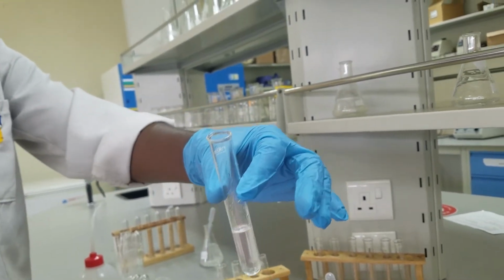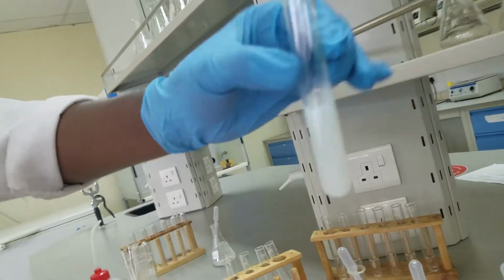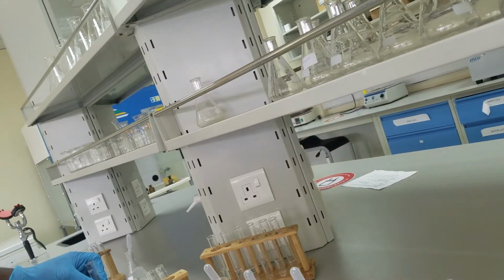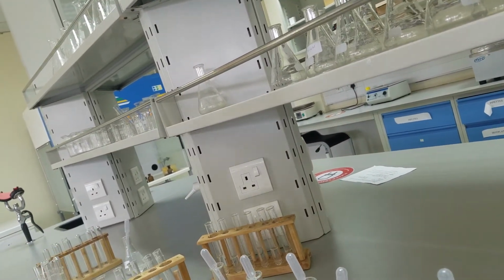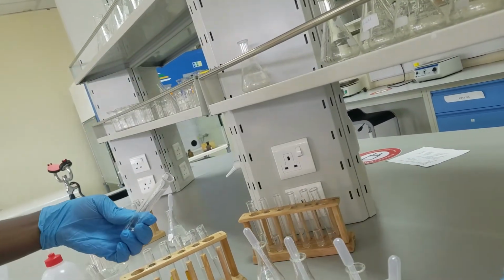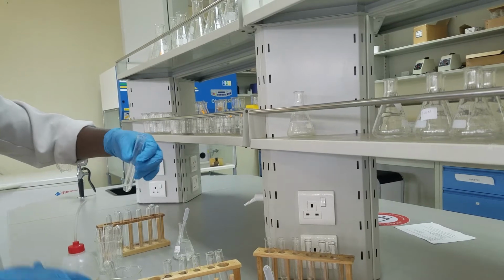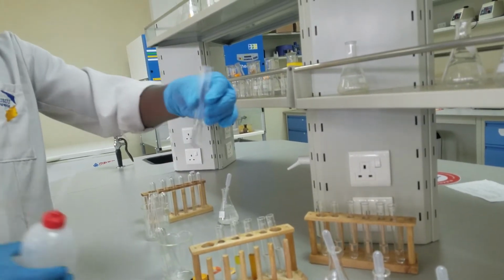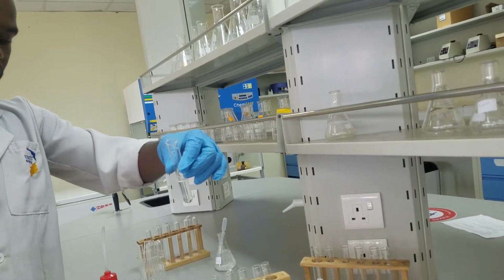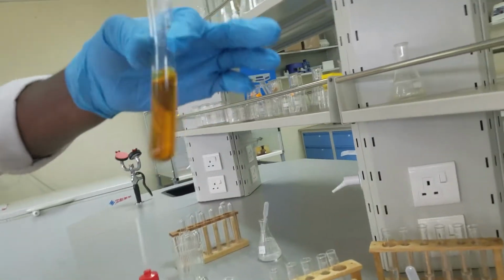Sodium hydroxide 10%, and our iodine solution. That is unknown B. Okay? And finally, unknown C. Some water, like that. Sodium hydroxide. That is our unknown C.